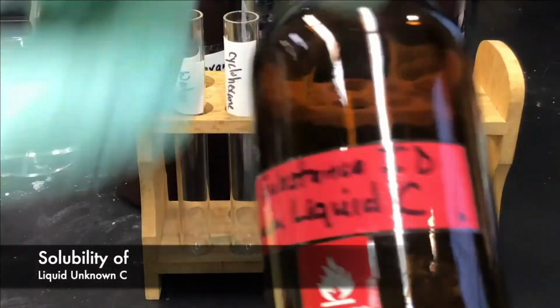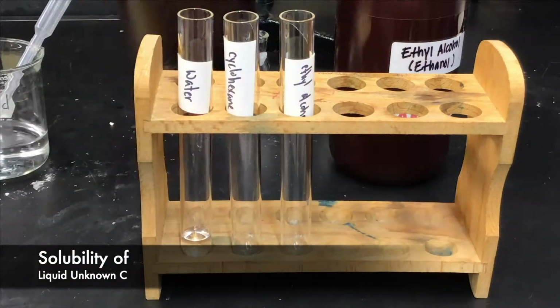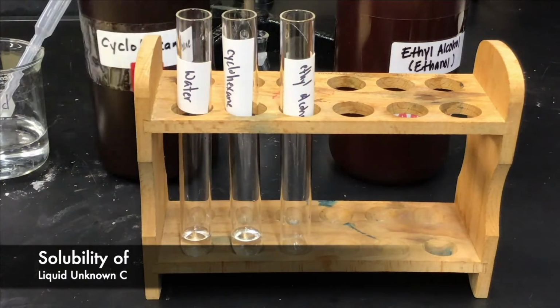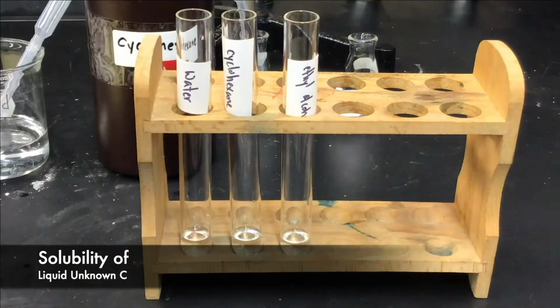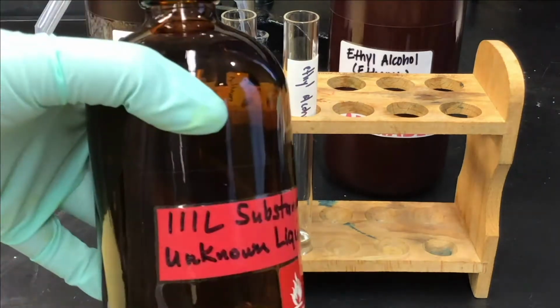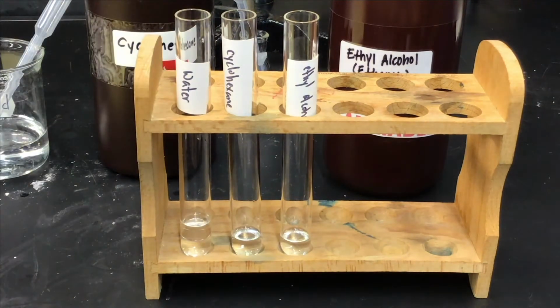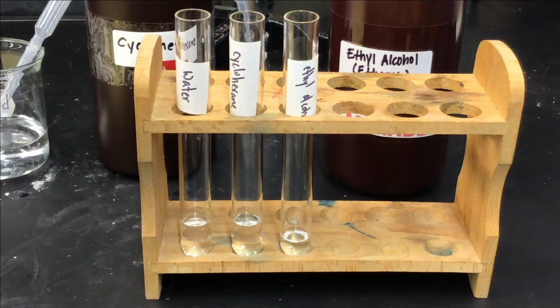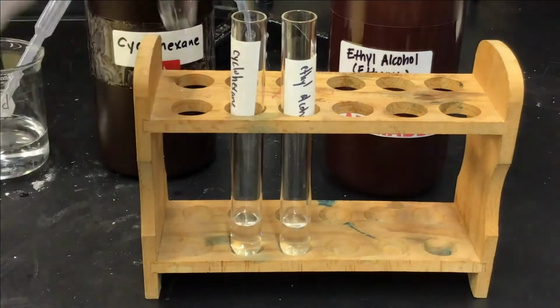Our final solubility test will be of our unknown C. Again, we're adding 2 to 3 milliliters of water, cyclohexane, and ethyl alcohol in labeled test tubes. This will be followed by 2 to 3 milliliters of our unknown C. Once our unknown has been added to each test tube, we're going to stopper and shake and see if our unknown is soluble.